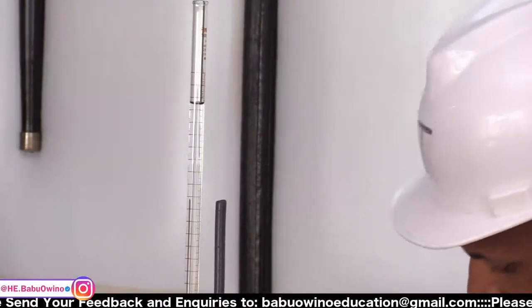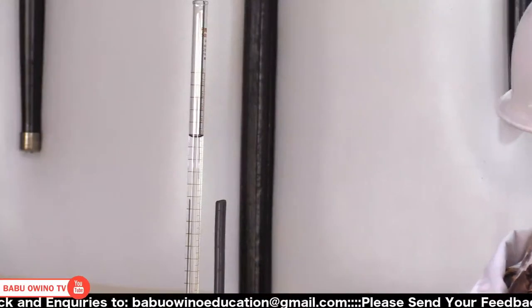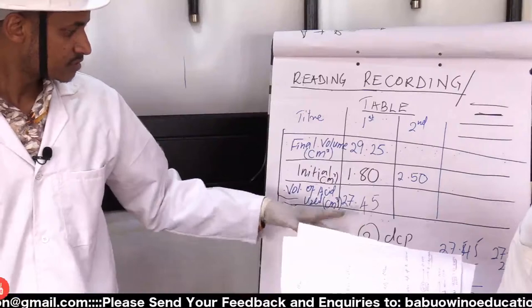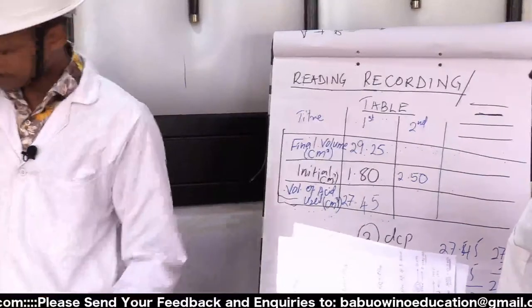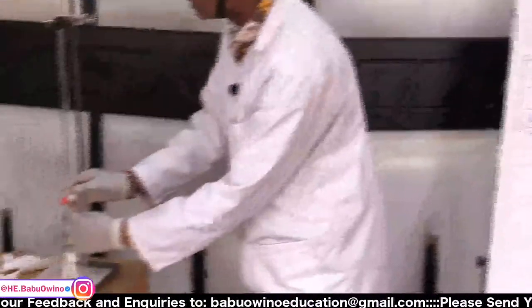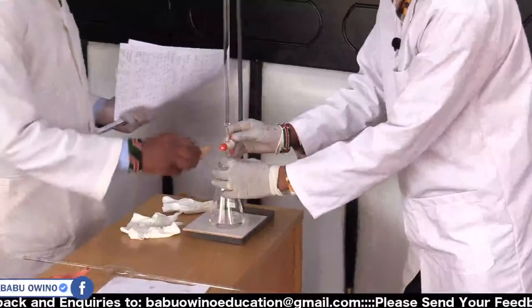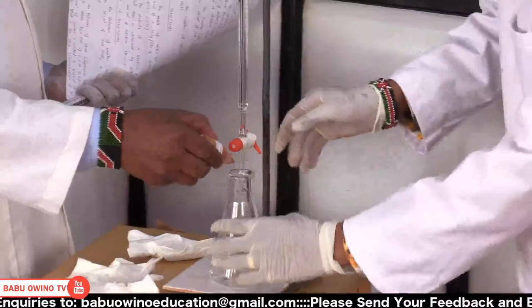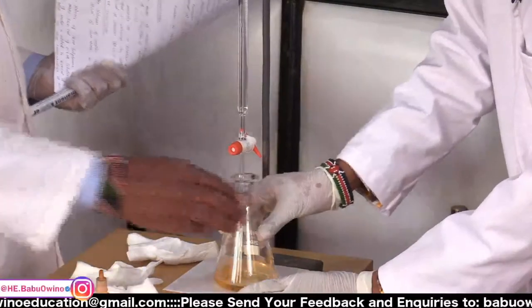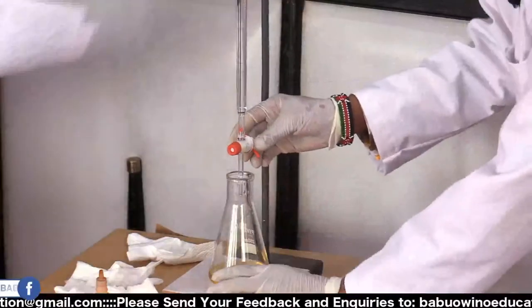Then again, we release it. 2.50. So what we should be getting is around 27. So if you add 27 to 2.5, we'll release it up to around 29.95, which is around 30. So you just release it up to around 20, and then we start going slowly. Two drops of the indicator. Okay, then release.